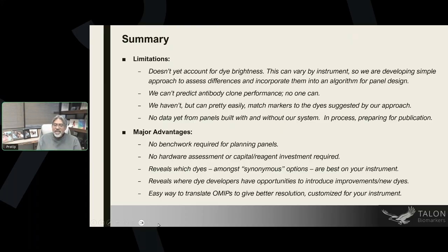One of the things that we have done is compare it to the complexity that is calculated by, for example, the Bigfoot. And we're finding that our system with simpler panels correlates very well with the complexity that the Thermo Fisher system calculates, but with larger panels that we think are really complex, the Bigfoot sort of sees them as less complex. So there's a disparity there that we can start to get at with some experiments.